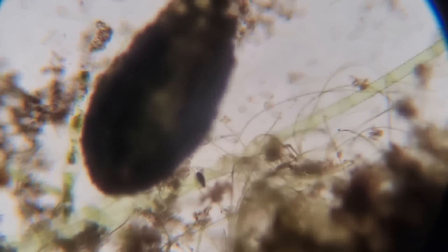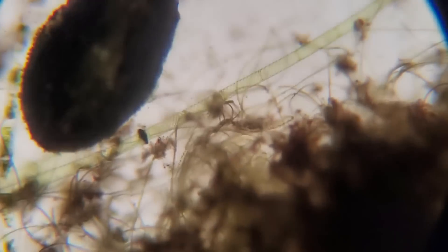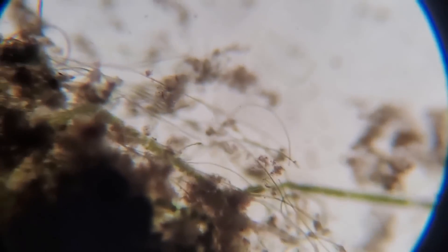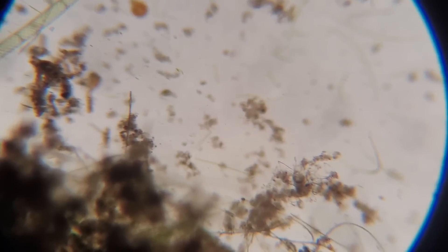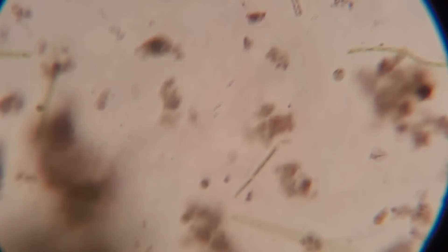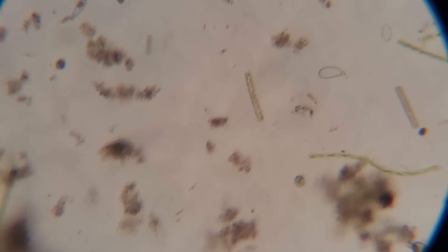Here it looks like a little cyclops that has passed away. Just the layers of life within even just one cubic millimeter of material on a slide is incredible. You can see all sorts of life right here. And if we go in at 400 times zoom — that's 200 times zoom — we're going to see even more life and more diversity.